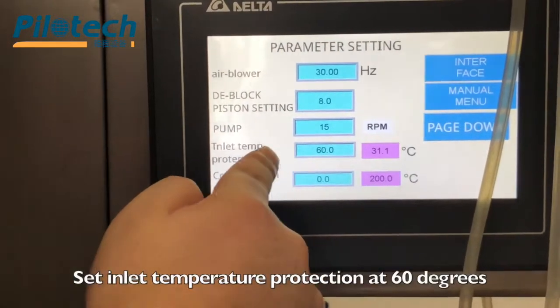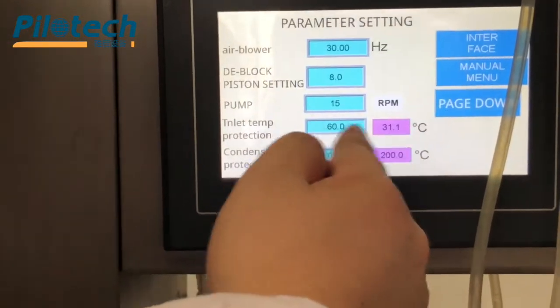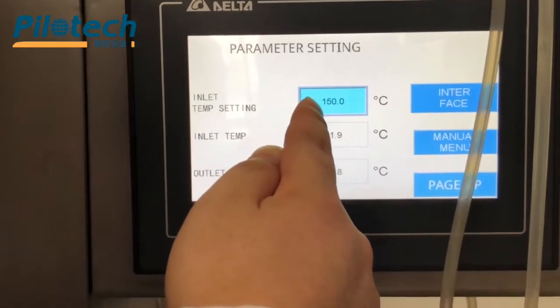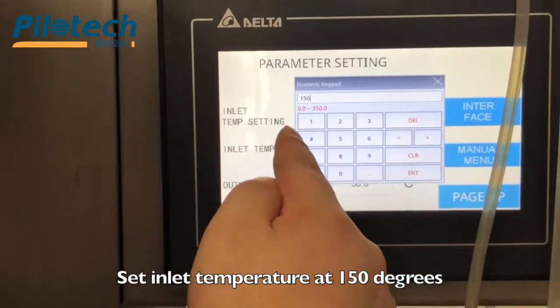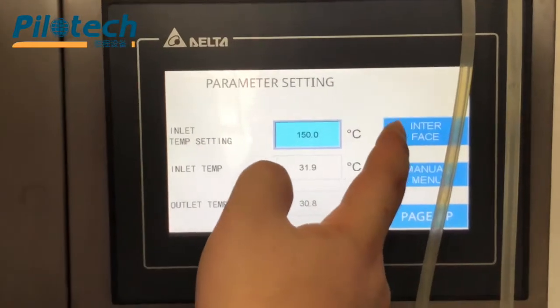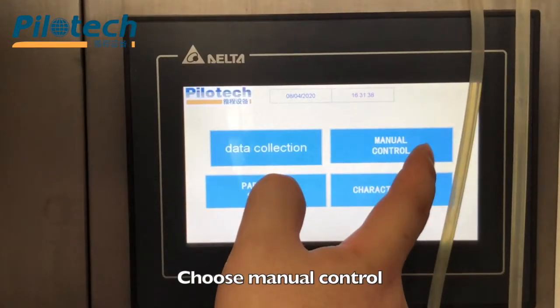Set inlet temperature protection at 60 degrees. Click page down. Set inlet temperature at 150 degrees. Choose interface, then choose manual control.